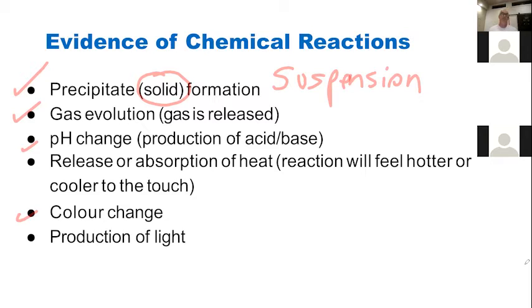We saw during the titration of our weak acid, when we added just enough strong base to balance the moles of acid, we saw the phenolphthalein change color from clear to pink. And that was because of the pH change. The phenolphthalein went from being an acid, to becoming a base. And when it's a base, it is pink in color.